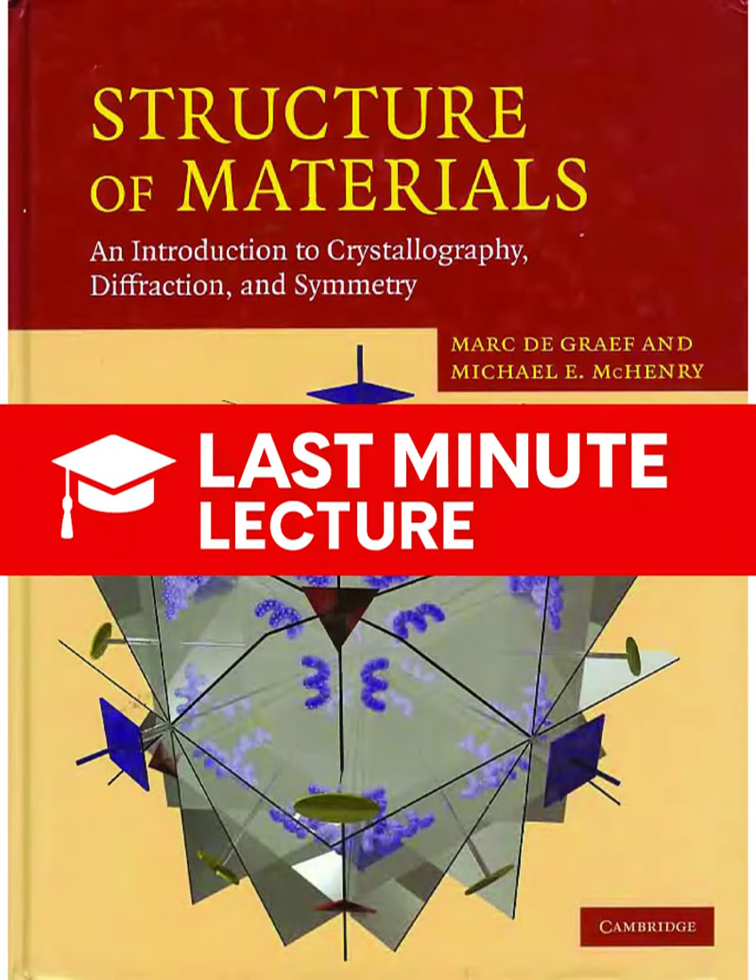Unlike visible light, which has wavelengths in the hundreds of nanometers, X-rays typically range from, let's say, 0.01 to 1 nanometers. Okay, and why is that range so critical? Well, because useful diffraction only occurs when the wavelength of your probing radiation is comparable to the distance between the things scattering it. In a crystal, that's the atomic centers. You basically need a ruler the same size as the thing you're measuring. That makes perfect sense. And we attribute the discovery, of course, to Wilhelm Conrad Röntgen.